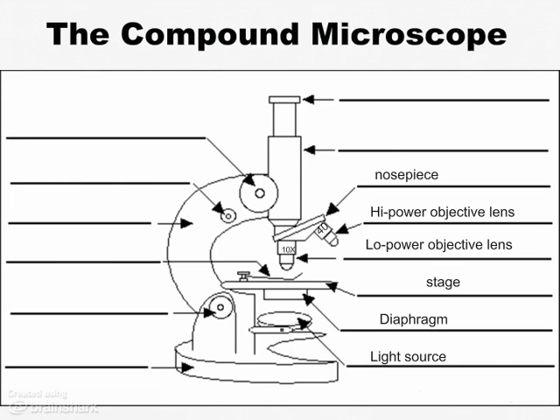In order to switch between the low and high power, we have a revolving nosepiece. This here is called the body tube — it's a length of tube that keeps the two lenses at a fixed distance from one another. The last lens that the image goes through is called the ocular lens, which is just a fancy way of saying eyepiece. All these parts make up what's called the light system of a light microscope.